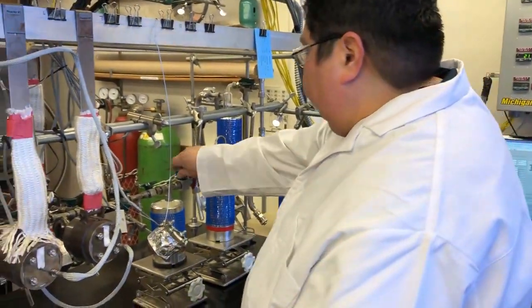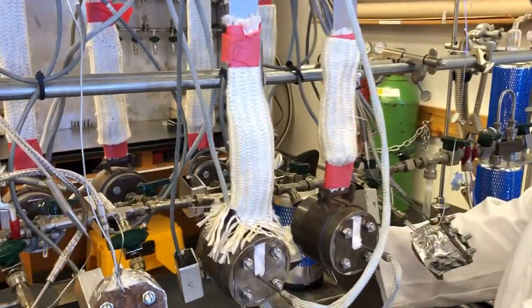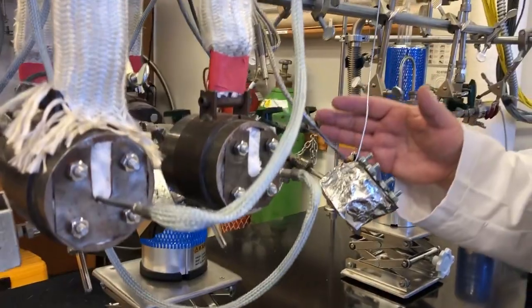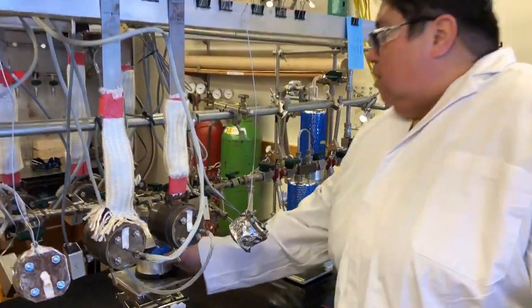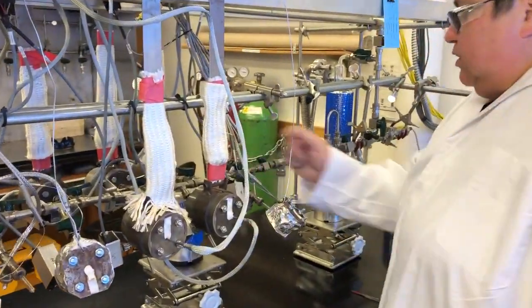So now that I've got my sample isolated here, I'm going to put it into an individual reactor. Now this reactor has had some iron added to it previously, and that iron is going to be the catalyst. So I will transfer my CO2 into this reactor now.